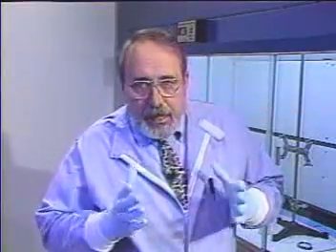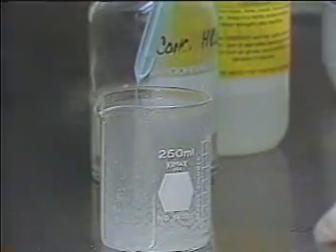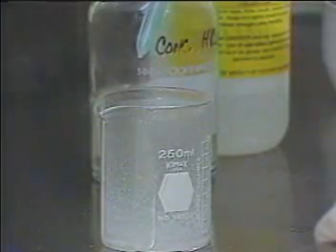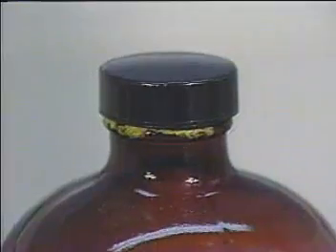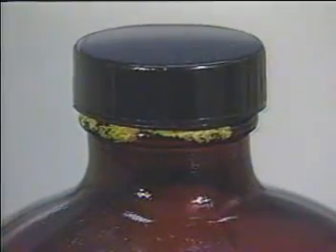Some chemicals are affected by increases in temperature. They decompose quickly or become dangerously reactive. These are the explosives. Light, mechanical shock, and certain catalysts can also begin a reaction. Some chemicals form an explosive compound when mixed, such as calcium carbide with water. Impurities in a sample can also be dangerous.